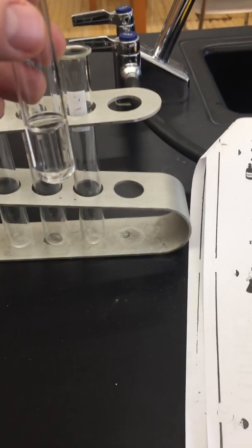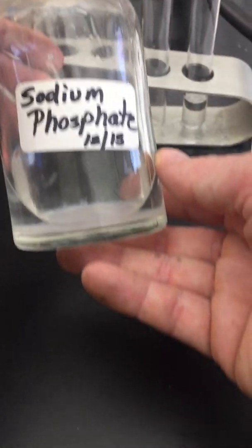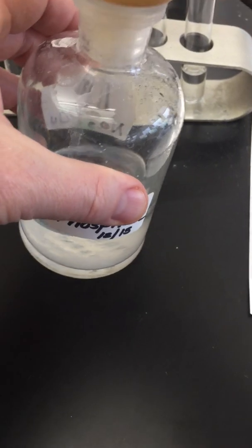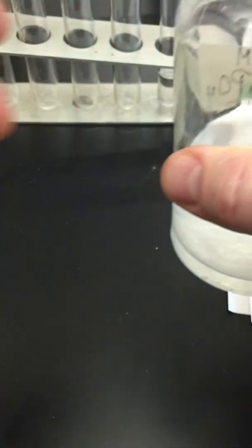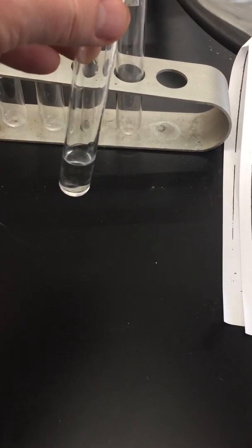I'm going to take some sodium phosphate tribasic, sodium phosphate, and I'm going to pour it in there, and you'll see what happens instantaneously.